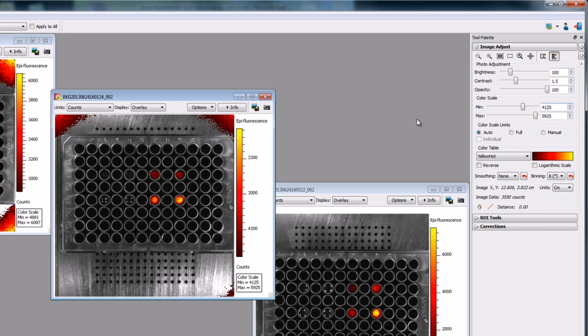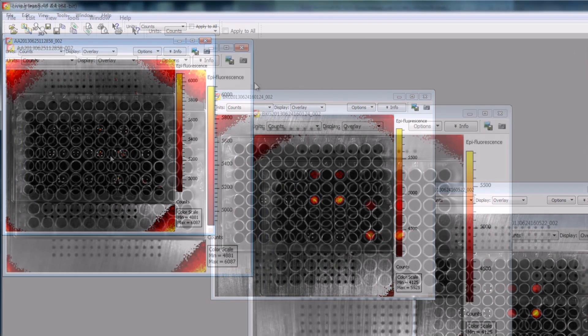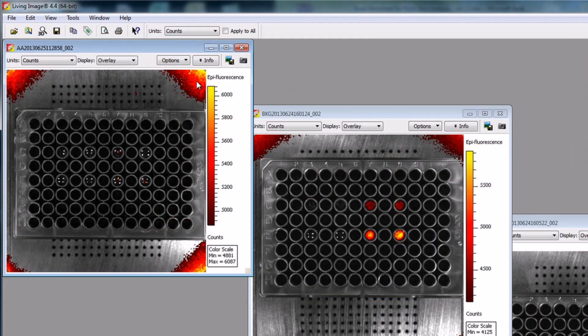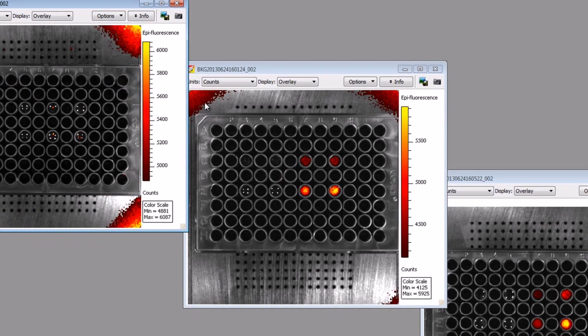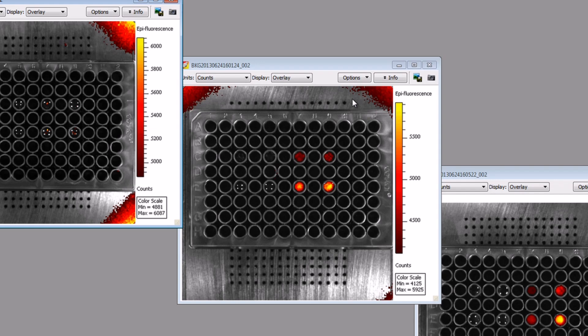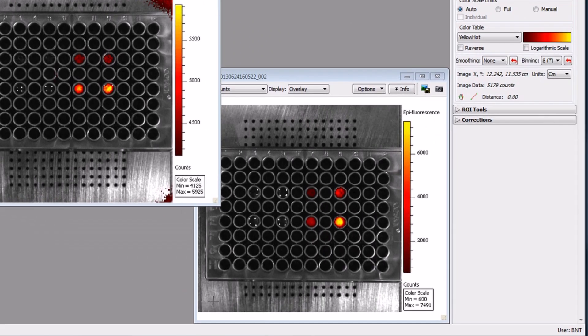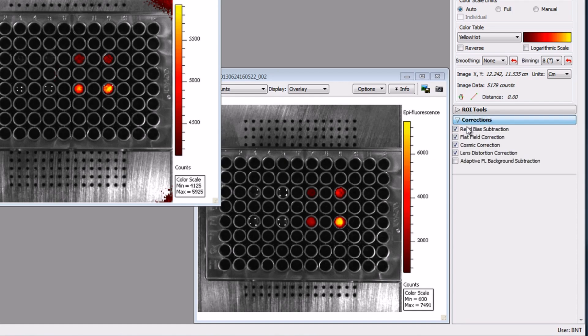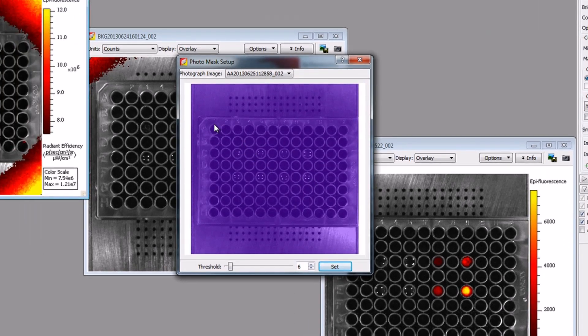With fluorescence imaging, we require an excitation light source to visualize our probes. Typically, the excitation and emission filters are very close together. Reflection off the stage may bleed through the emission bandpass filter due to the close proximity and present as a ring on the stage as seen here. This artifact may be more pronounced with some filter pairs due to differences in spacing between the filter pairs for the individual probes. To correct for this phenomenon, go to the tool palette, select the Corrections tab, and select Adaptive Fluorescence Background Subtraction.